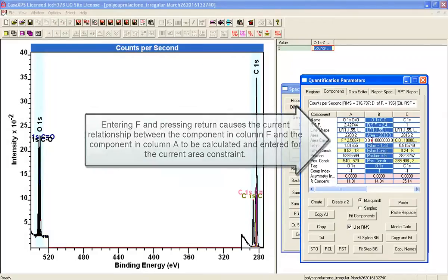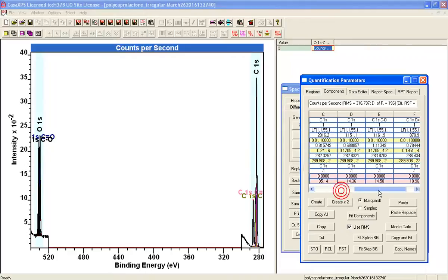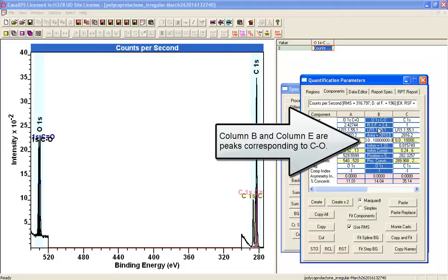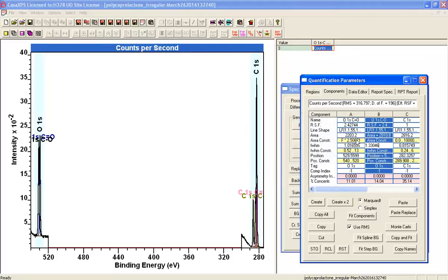The other thing is that I need the value of the relationship between the single bond O, which is in column E, and the single bond O oxygen peak. If I now go in here and type E and press return, you can see how that relates. That's slightly different.